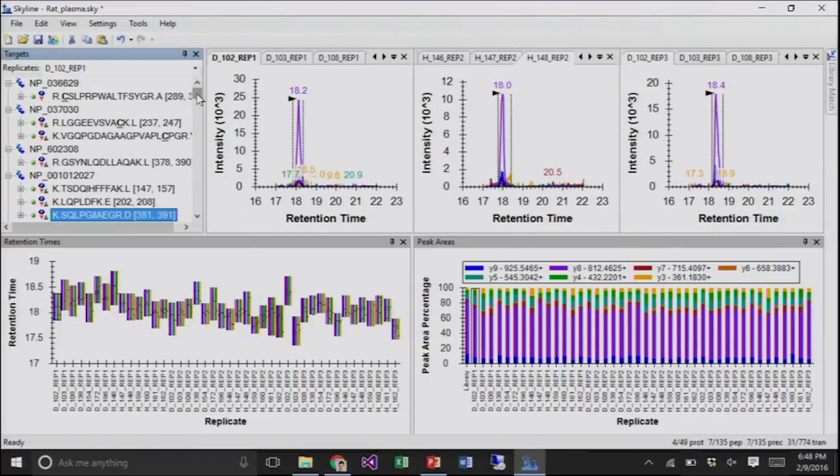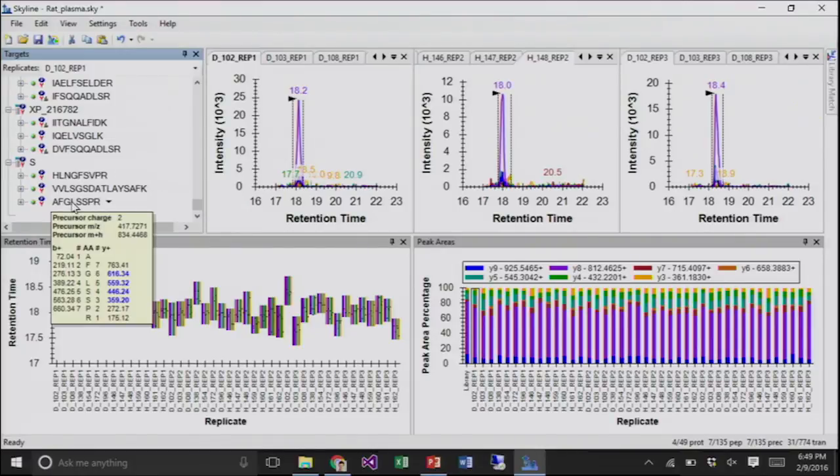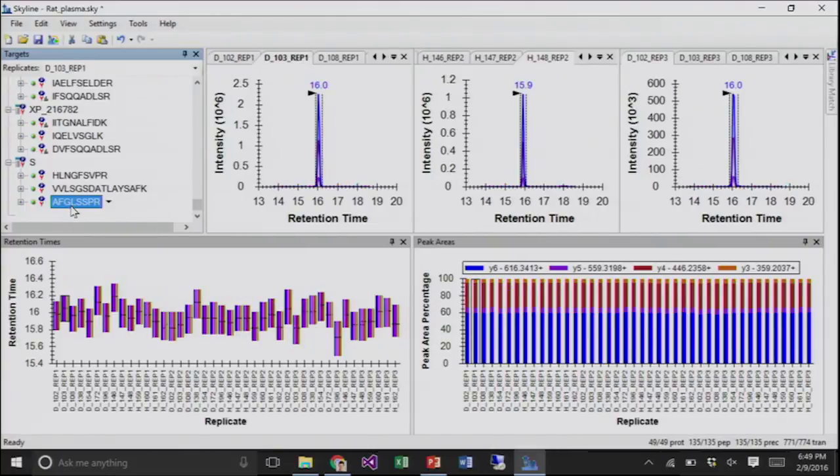But I want to go down and look at these 3 peptides at the end, which are standard peptides. So those are global standard peptides. These peptides were injected in order to normalize everything else too. So the idea being that we have just said that we think that we might have systematic signal degradation. We said from looking at those technical replicates that it was going down, and so maybe our standards will show us the same thing. Let's just first check on how they're integrated. So if we look at the bottom one, anybody see any problems with the integration here?